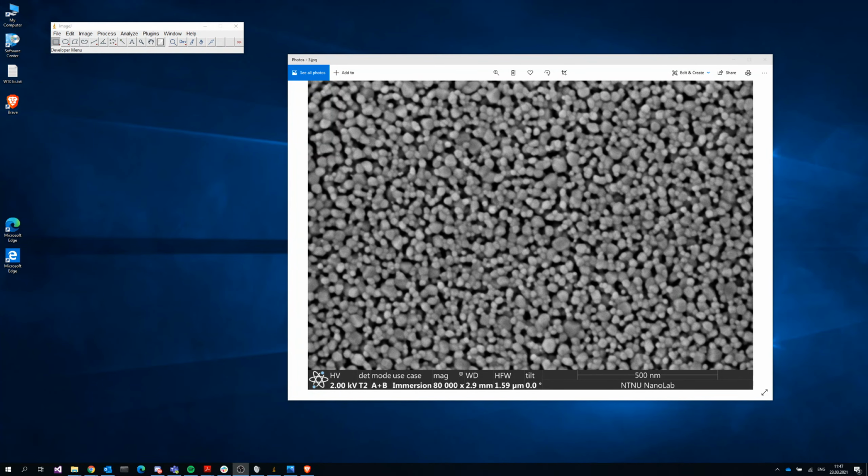Okay, hi everyone. This is going to be a quick video just to show you all how to do the actual size analysis of the nanowires that you're going to be imaging in the cleanroom. And what we're going to be using is a program called ImageJ. I'm sure most of you have heard of it, but it's free and it's a pretty powerful tool for extrapolating crucial size dimensions of nanotechnologies like these nanoparticles or the nanowires that we're working on.